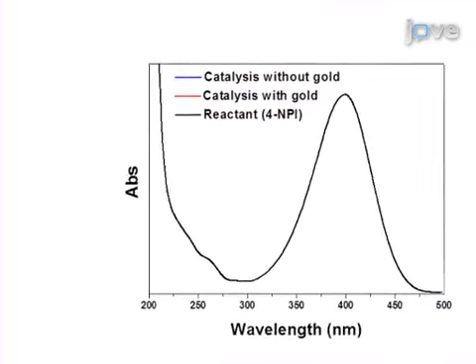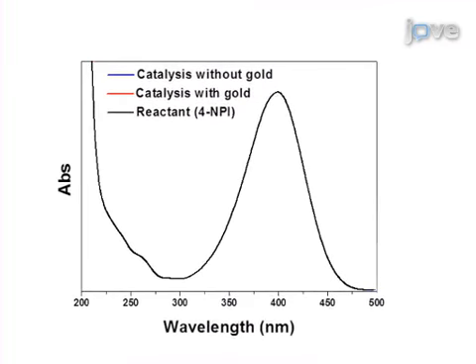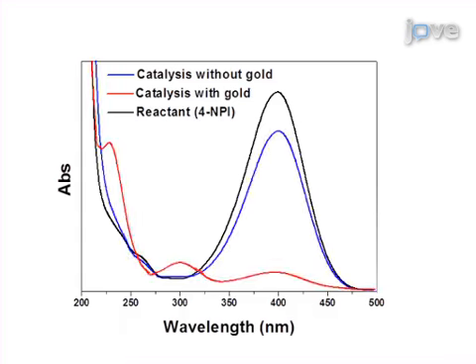In the final part, continuous flow catalysis is demonstrated by the conversion of 4-nitrophenol to 4-aminophenol as it is flowed over gold nanostructures within the millifluidic chip.